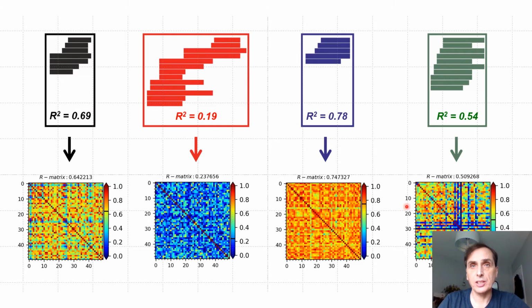So as mentioned in a previous video, the recommended workflow for HDXmodeller is that data should first be split into different subsections, and then each subsection of data submitted for optimization separately.